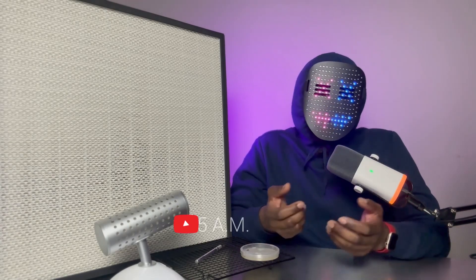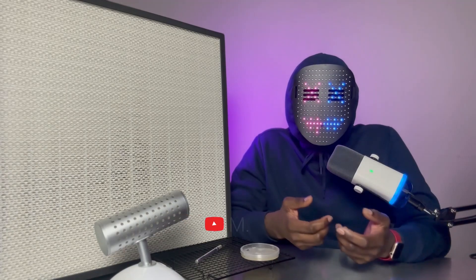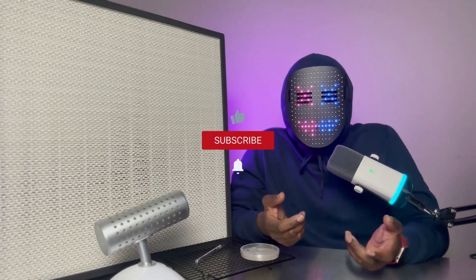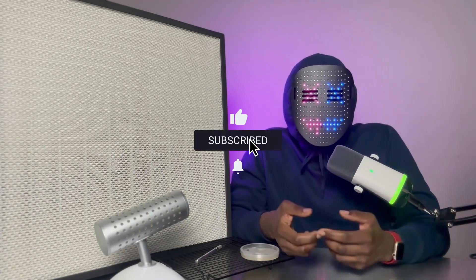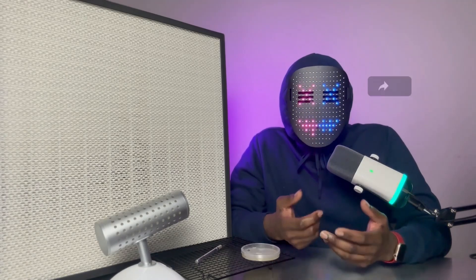So in this video, I'm going to be showing you guys how to prepare your grains using the Wild Bird Seed tech. This is one of eight videos in my Generating Grain Spawn series that's going to be available on Patreon. Before we go downstairs and get started in the kitchen, let's go over a few things that you're going to need to follow along.